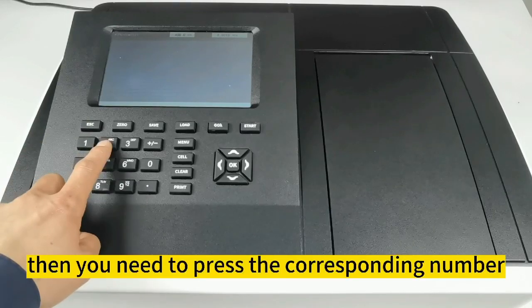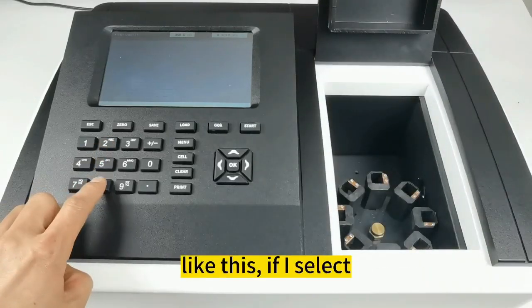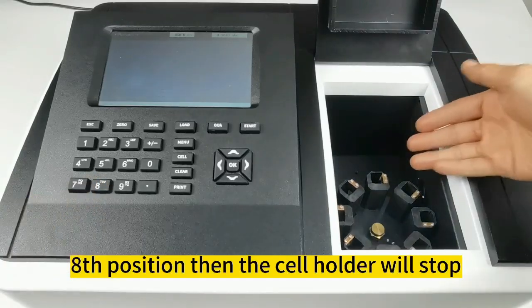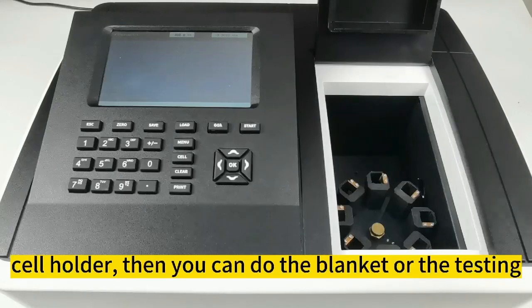Then you need to press the corresponding number for different positions, like this. If I select position 8, the cell holder will stop at cell number 8, and then you can do the blanking or the testing.